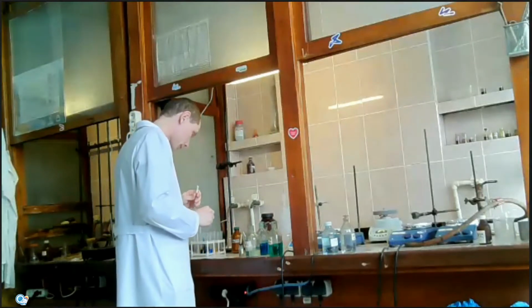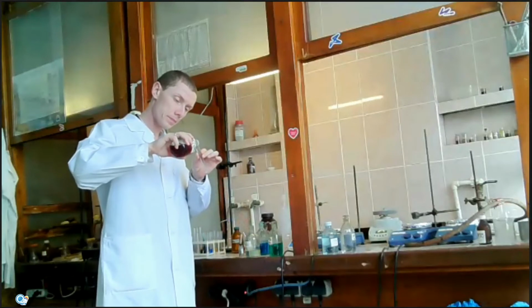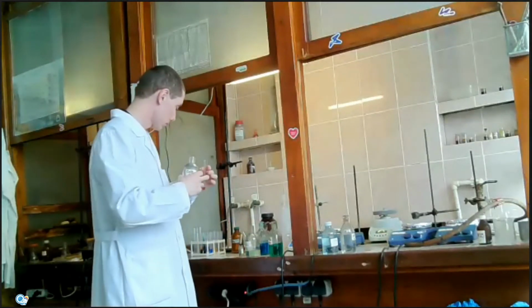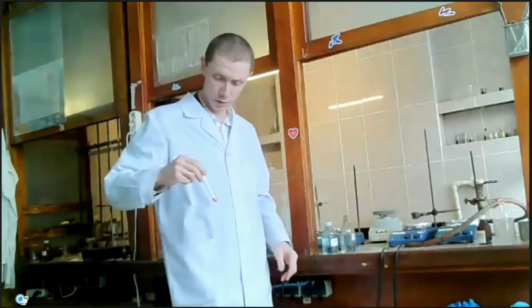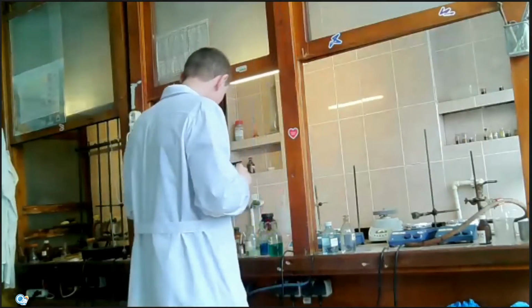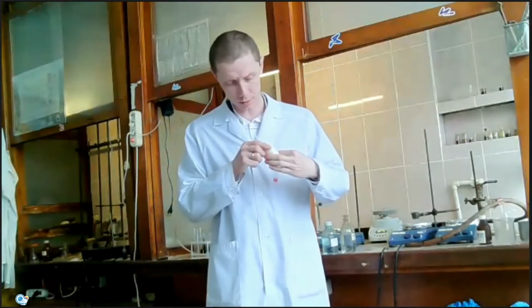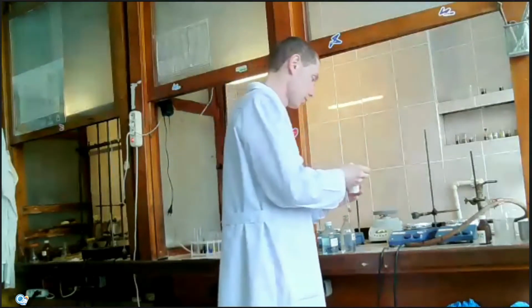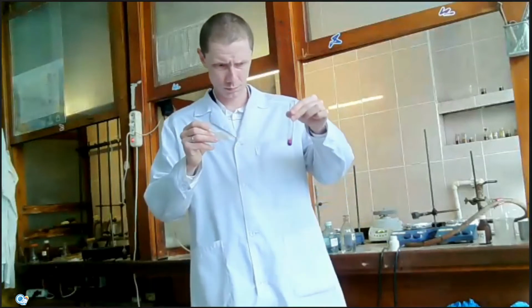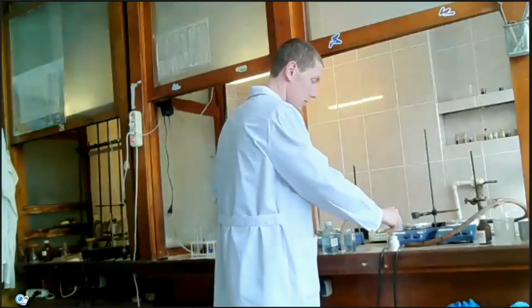Next experiment. If I take the cobalt salt, for example, cobalt sulfate, this pink color solution, and if I add the solid ammonium thiocyanate, color changes to purple because of formation of complex.